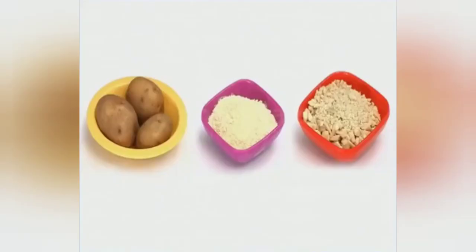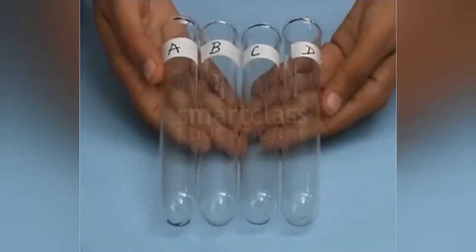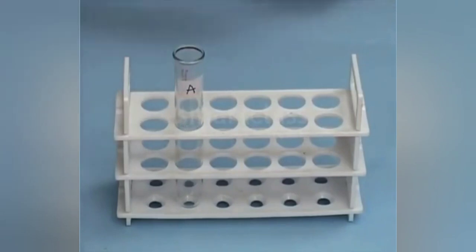Let us first test the food items for the presence of starch. Take 4 test tubes. Now mark them as A, B, C and D and place them in a test tube stand.